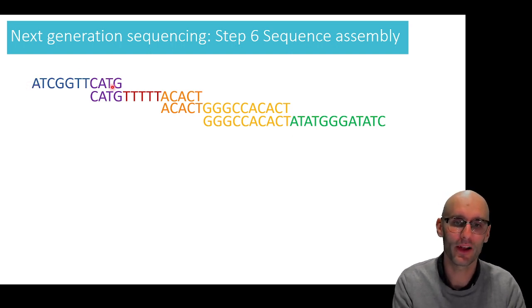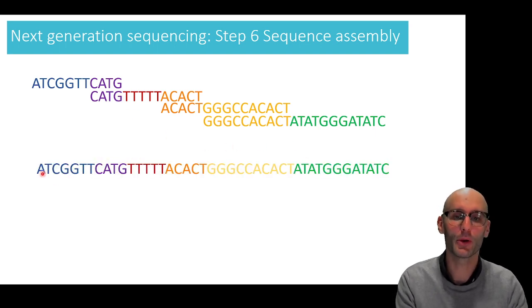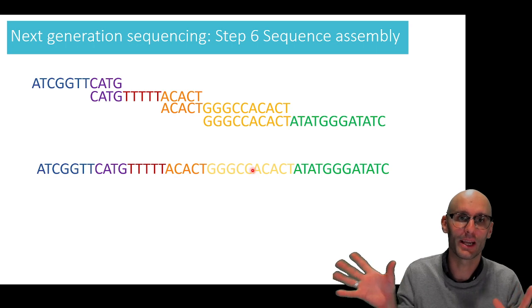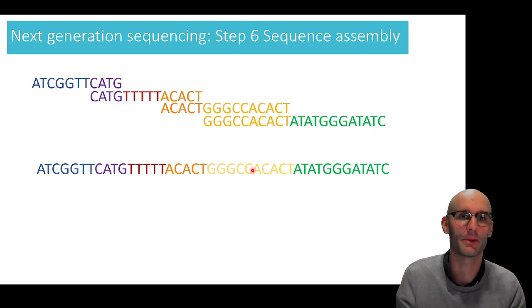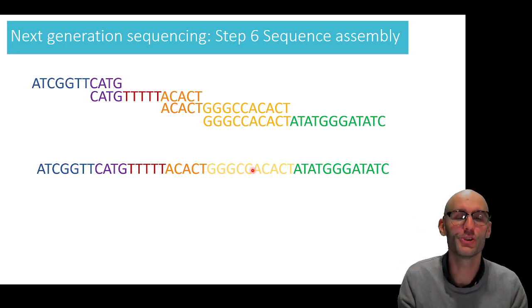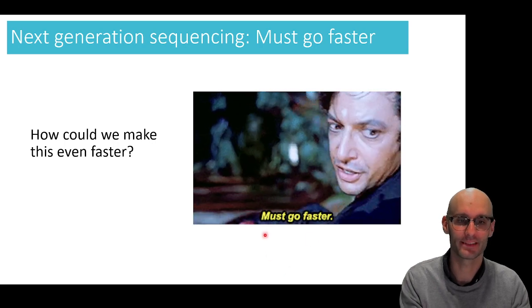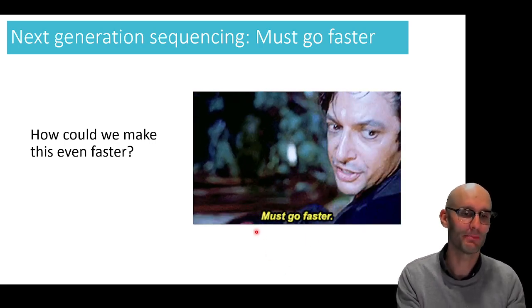So here's one of our fragments, and here's another one of our fragments, and due to this overlap, we know that this is a continuation from that fragment there. And so now we can build up our entire sequence, which is this. So now we have sequenced the genome of the thing that we just put in there. So we put in more than one copy of DNA, it fragments at random locations, we sequence all the fragments, and then we can overlap those fragments like a puzzle piece in order to deduce our single genome. And there's our single genome there. Nice. But how do we make this even faster?